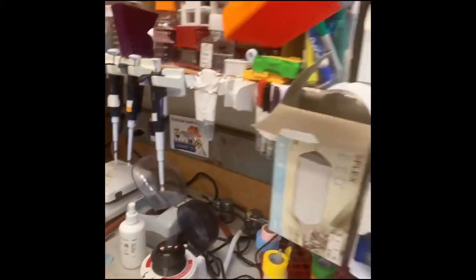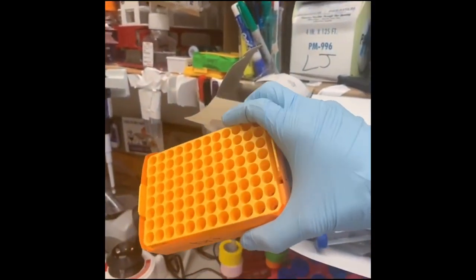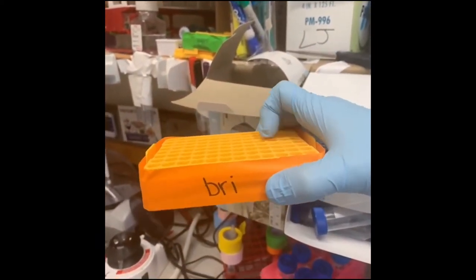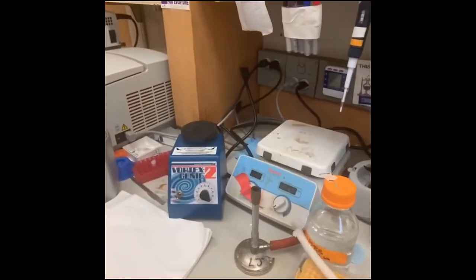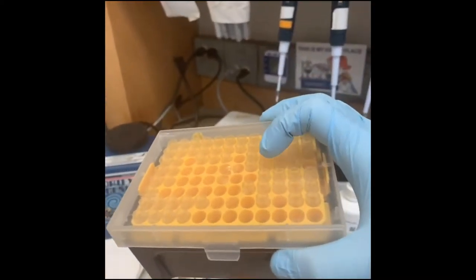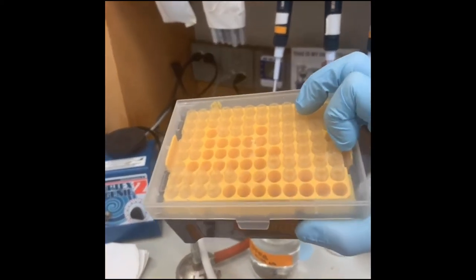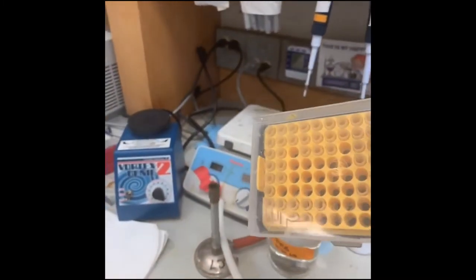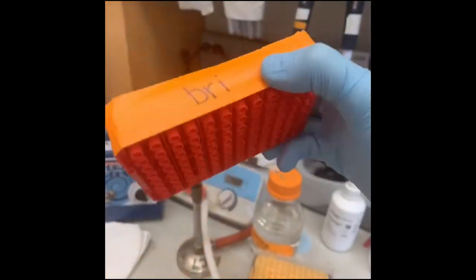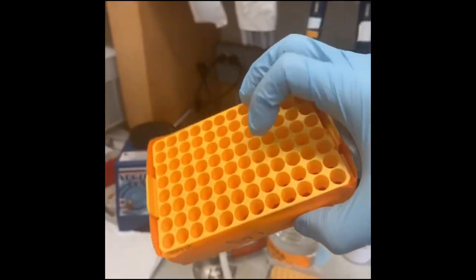A little tip: a really handy way to make a PCR strip tube rack is to take the tip racks. These tip boxes usually come in trays, and when you replace the tray you're left with an empty rack. Put a couple of them together and tape them and it makes a really good holder.